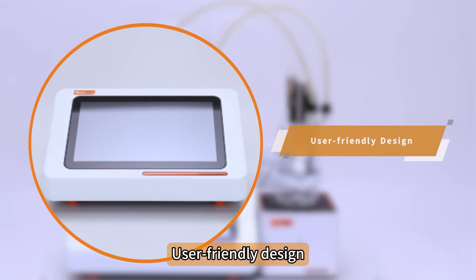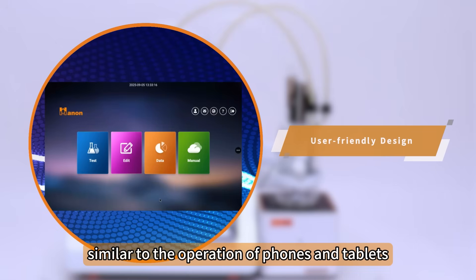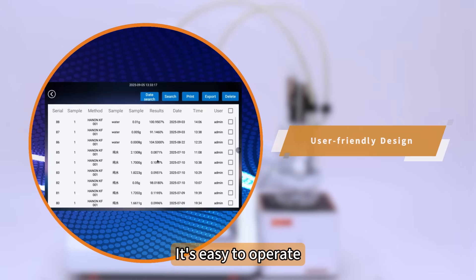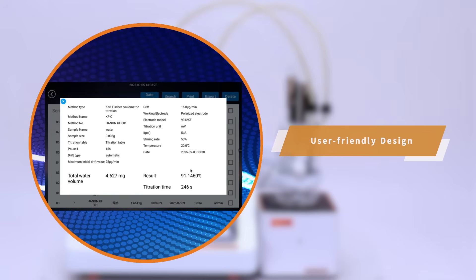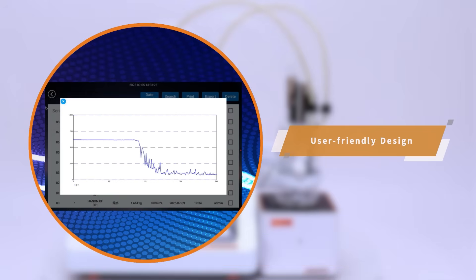User-friendly design, similar to the operation of phones and tablets. It's easy to operate. Click to set parameters. Swipe to view more data, which improves work efficiency.